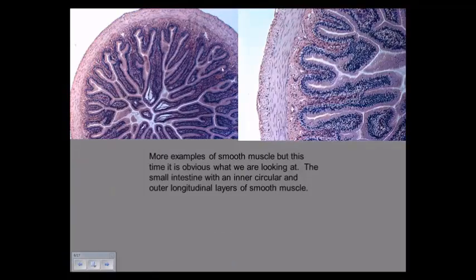Okay, here is a cross-section of somebody's intestines, probably a mouse. So here's all your mucosa in here. Here is the simple columnar epithelia. The lumen would be in here. Then you have circular smooth muscle and longitudinal smooth muscle. Here's a higher power of the same thing. Got it? And out here will be a single layer of cells. That's the visceral serosa. Okay? You finding your way around?